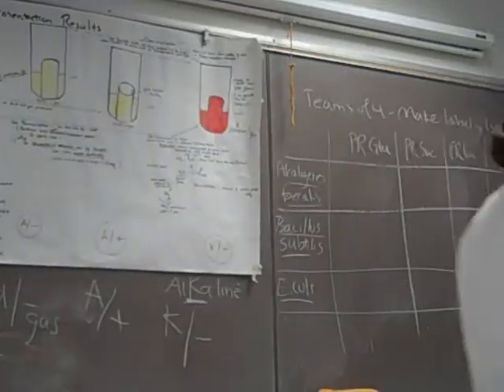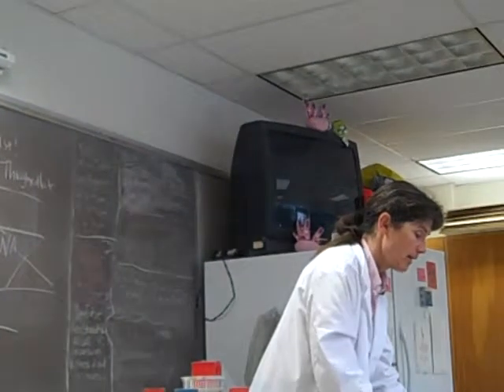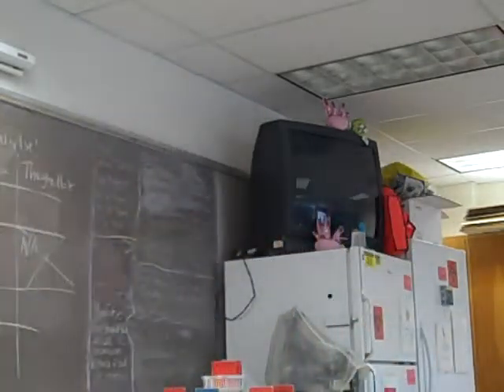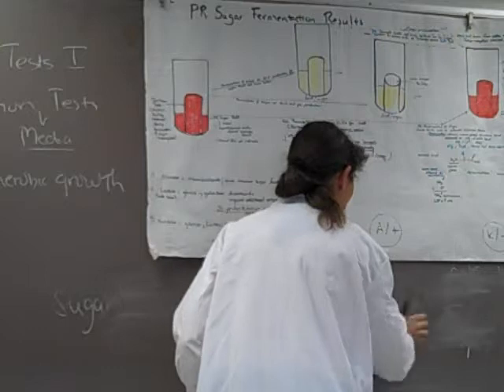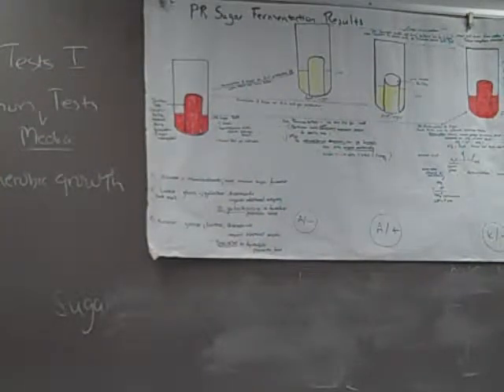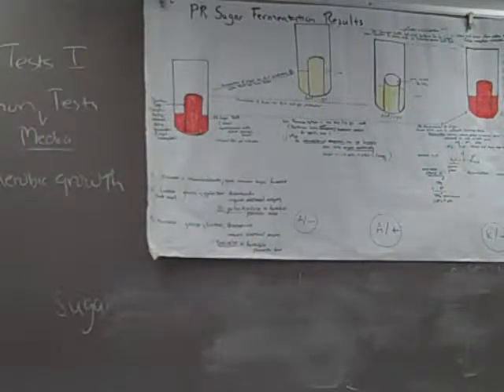Now, the last topic, you guys, and then we'll let you get to work, is we just want to describe the oxidase test. The commercial oxidase test that we used to use, we were getting really inconsistent results, and with the budget cutback and everything, we eliminated it from our so-called wet lab. But the oxidase test is a really important test in diagnostic microbiology, so I wanted you guys to know about it. There's a description of the oxidase test on page 139 up at the top.